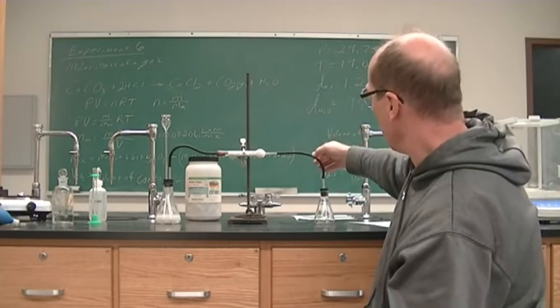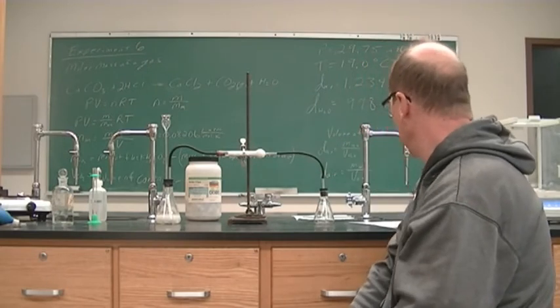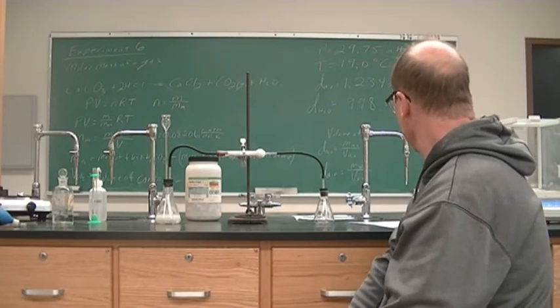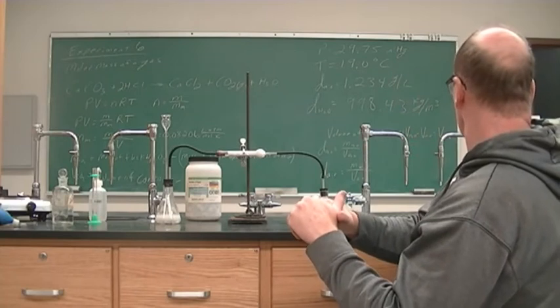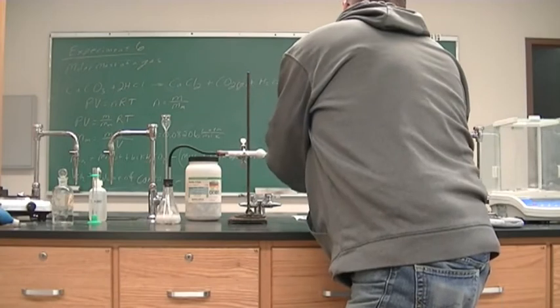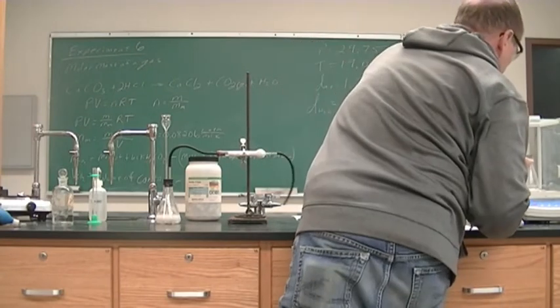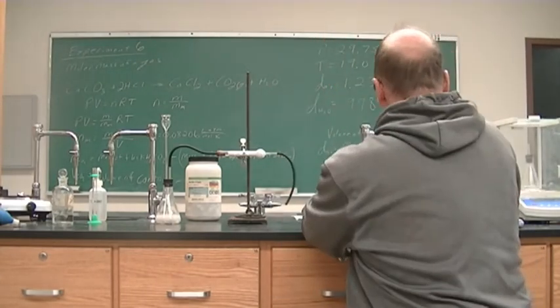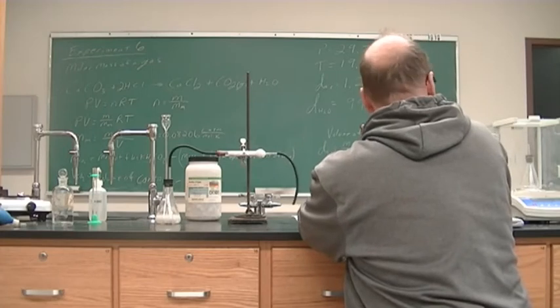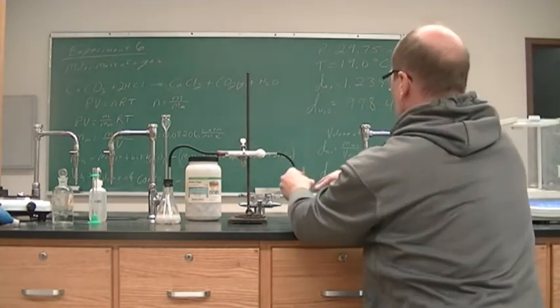Okay, but now we will definitely have plenty of CO2 generation going on, and we will most likely go with our next number that we get here. All right, it has set itself to 0. All right, so let's get this on our balance, get a mass. It is 69.2325, so it's still going up. So let's go again.